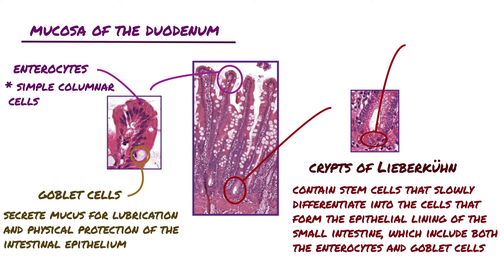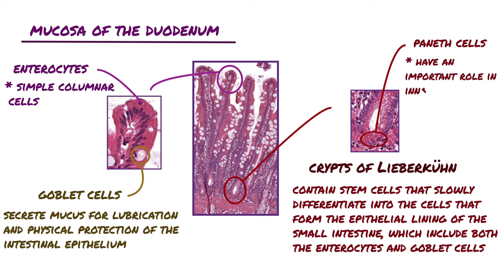Some of the crypts in the small intestine have cells with very eosinophilic, or pink, granules. These cells are called Paneth cells. Paneth cells are exocrine cells with large eosinophilic secretory granules in their apical cytoplasm. Paneth cell granules release molecules that bind and break down membranes of microorganisms and bacterial cell walls. Paneth cells have an important role in innate immunity and in regulating the microenvironment of the intestinal crypts.